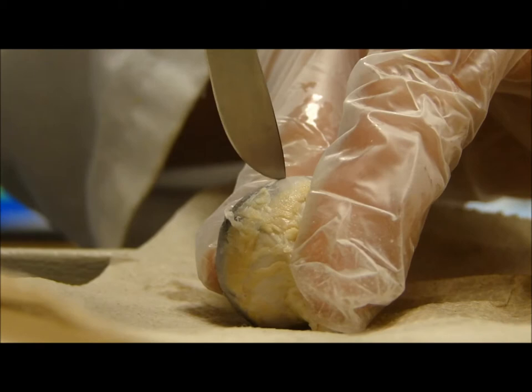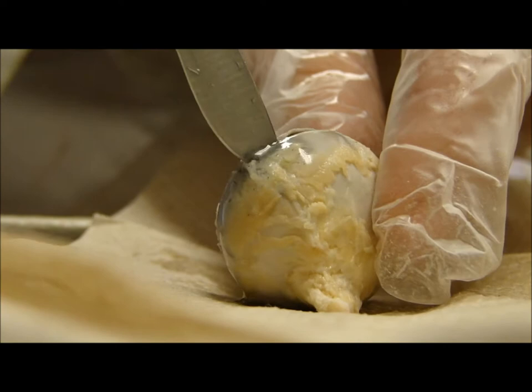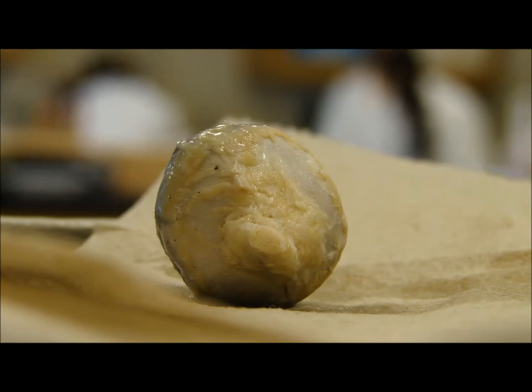Alright, I'm cutting this. Don't move. Right there. I hope it isn't squirting my... Oh my god, that's so disgusting. Ew. Okay, you do it.